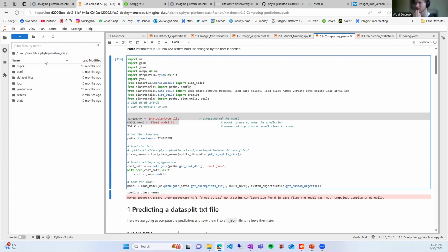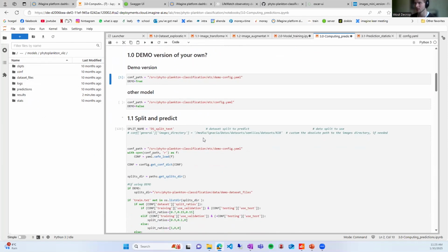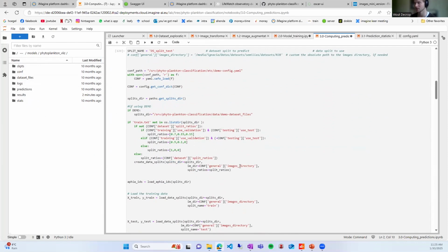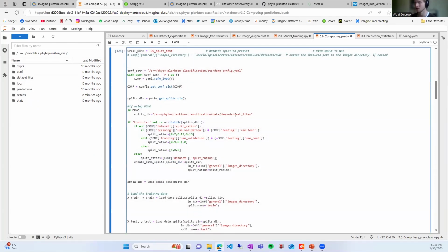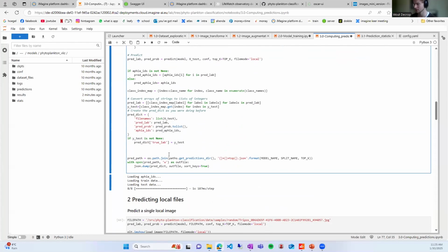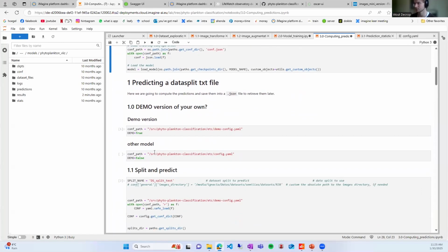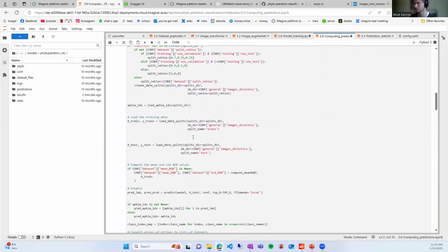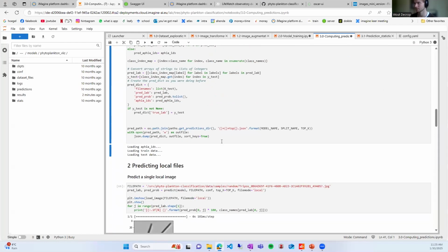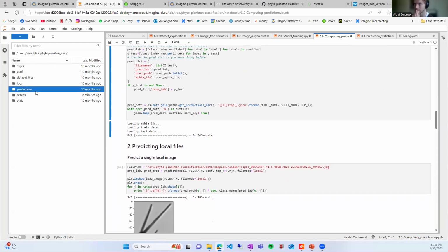So then in this VLIZ model, we can load this one, and then we can do some predictions again on our demo files. This script is just again splitting, saying if the data has not been split yet, it will split it. Otherwise, it will just load the dataset files or prediction file. It will predict on this, and then it will create a JSON file, or YAML. Now it's predicting just on these 8 files, and then we can take a look at the predictions.